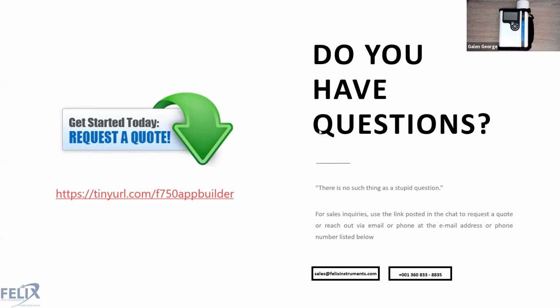All right, the next question from Nazar is, hi, do you think it's possible to make a reliable model for potatoes? I do. I think that is a great application, and I already know of a couple people that have used NIR spectroscopy to build models for potatoes. If you want more information about how we think this application could work for you, then I would recommend you reach out to me directly, and you and I can discuss this application specifically.